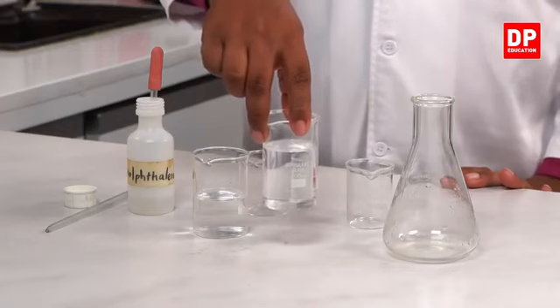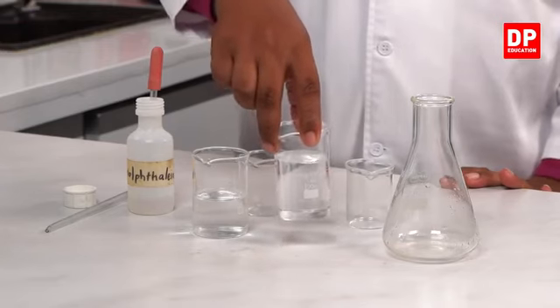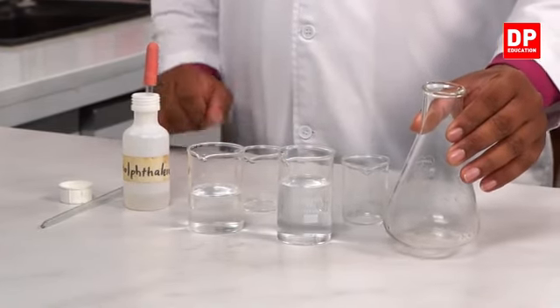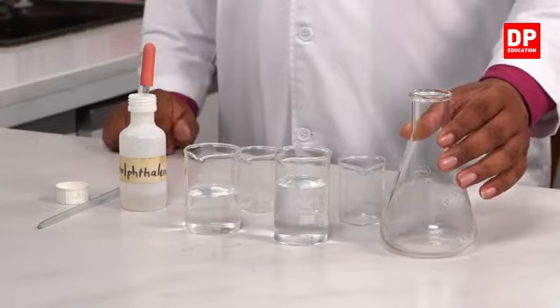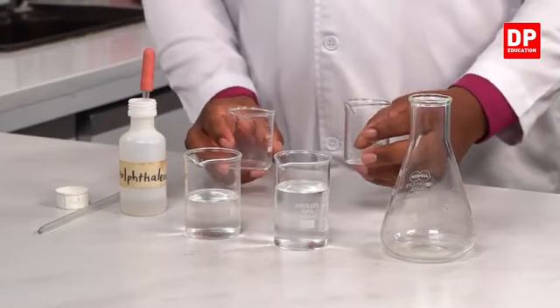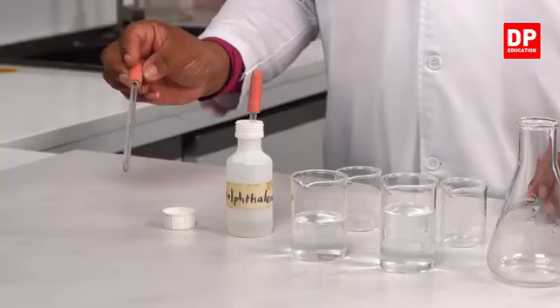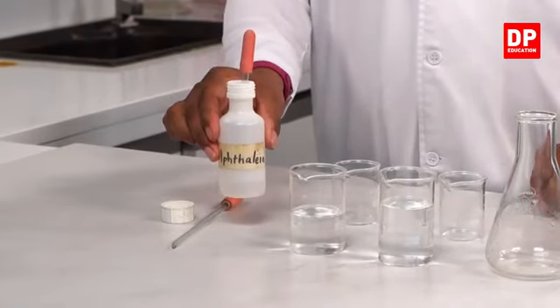HCl means hydrochloric acid. A vessel to add these substances separately and get clearer observations. I have another two separate beakers to measure these liquids separately. And finally, I have a dropper plus some phenolphthalein as the indicator.